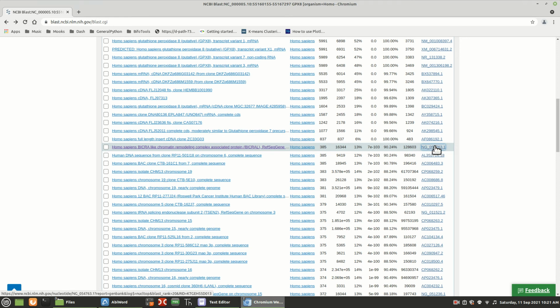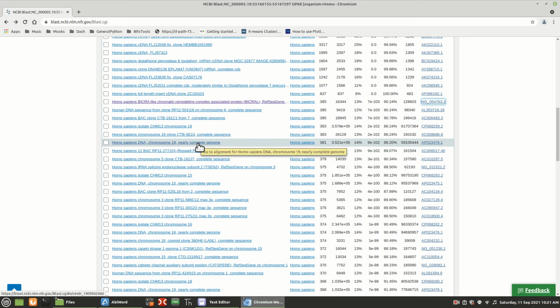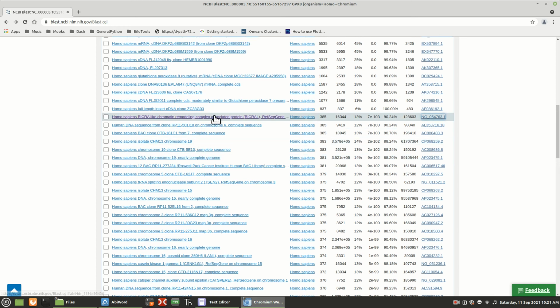For this one, this one's a little long. You can pick whichever ones you want. You might look for some smaller ones, but it would be interesting to find out what pieces here are similar to these other genes and see how those match up with your previous assignment.